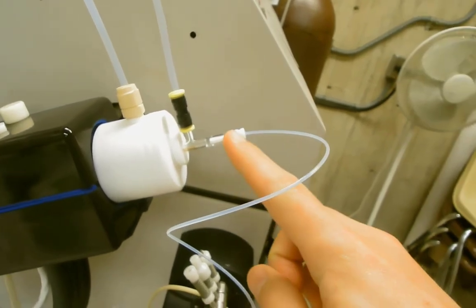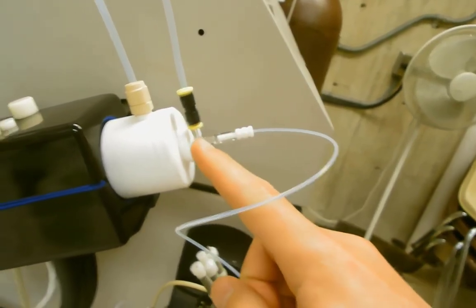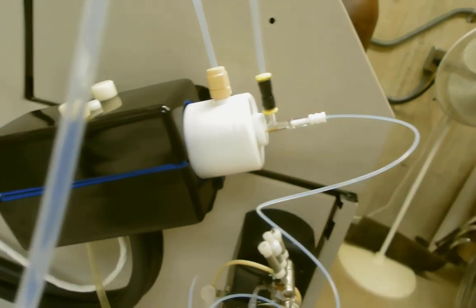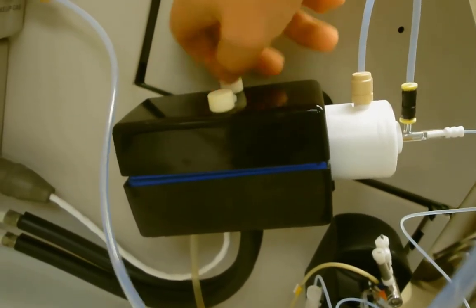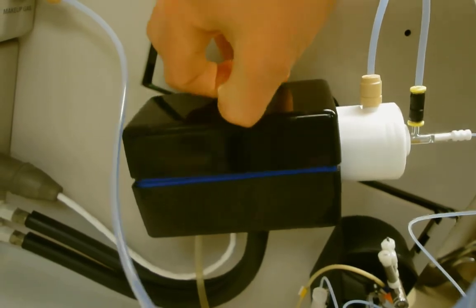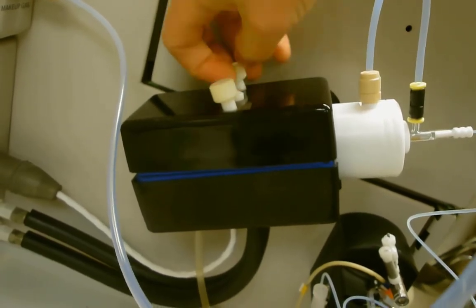So here's the nebulizer, where it combines the sample with argon and sprays it into a very fine mist. And then it proceeds to the mist and the argon. The argon carries the mist through the spray chamber.